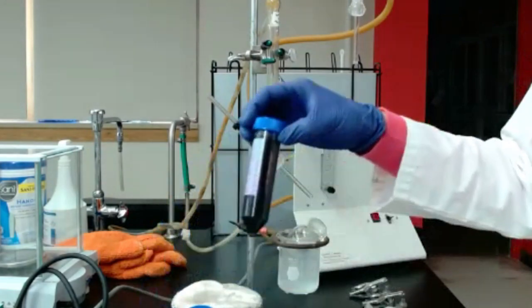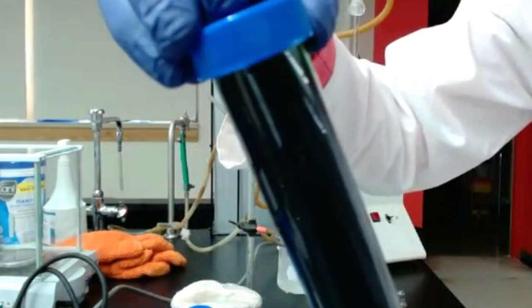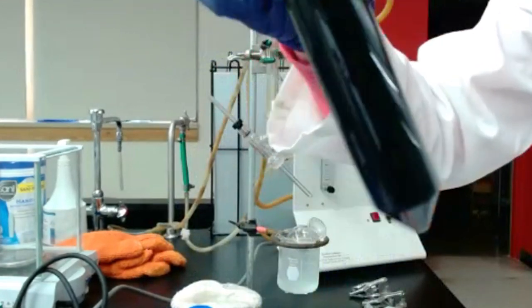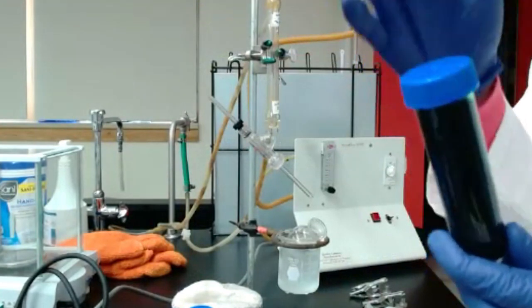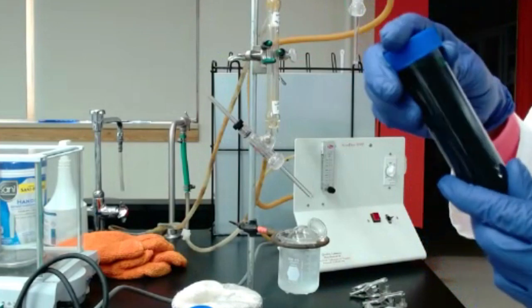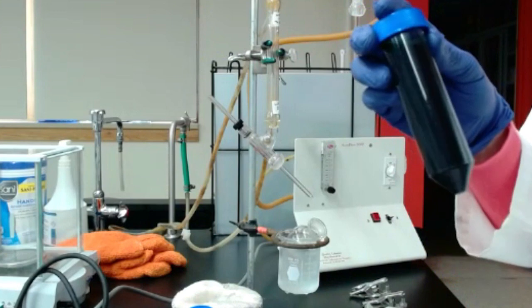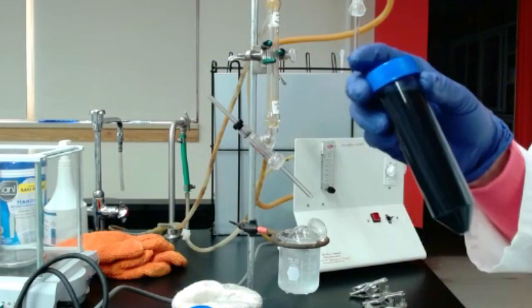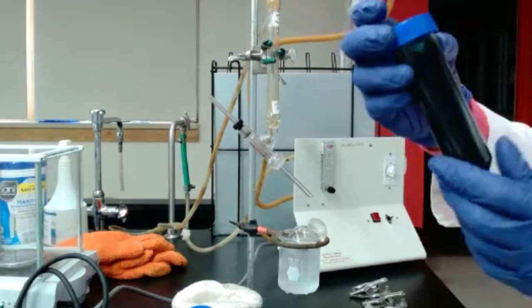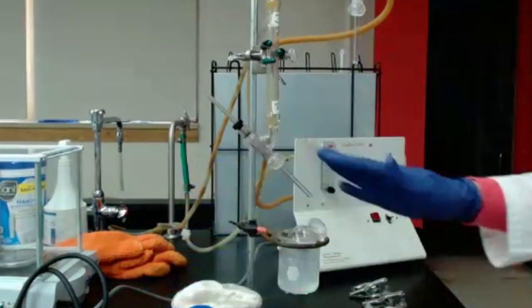Also, you will need to have a color indicator. You can see that's pretty dark green. It's really difficult to see, but it's a really dark green color indicator. If you don't have it already prepared, you can make it at home or in your winery. That's a mix between methylene blue and methyl red. So it's two compounds combined together in an ethanol-water solution. And that's what you would use to look at the color change. So make sure you have those three solutions ready.